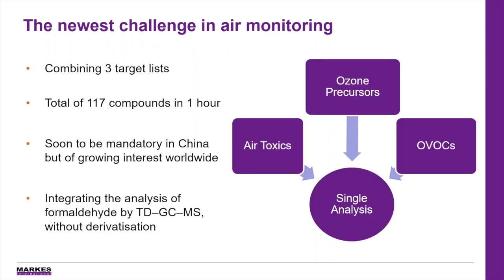Now, what's being approached at the moment is combining these three lists for a total of 117 compounds measured in a single analysis in 1 hour. Now, this is a method that's soon to be mandatory in China, but it's of growing interest worldwide as labs try to expand what they can achieve in a single analysis. And again, of specific interest is the integration of formaldehyde here. This is one of the only methods where you can analyze formaldehyde alongside other VOCs without any need for derivatization.